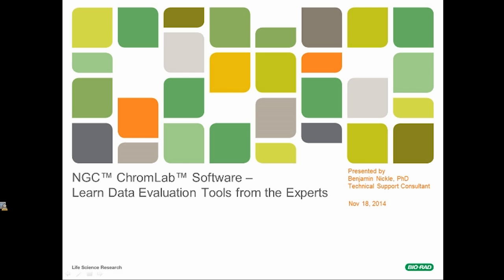This software is designed to be easy to use, and it should also be fairly intuitive. The title of today's webinar is NGC ChromLab Software: Learn Data Evaluation Tools from the Experts. The goal of today's webinar is to provide you with an understanding of the various tools that are available to you to aid in the analysis of your NGC run data, as well as to enhance the visual presentation of your data. The presentation today will focus on the data evaluation aspects of the ChromLab software.